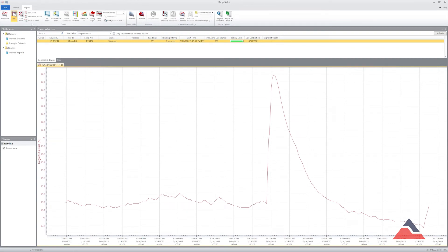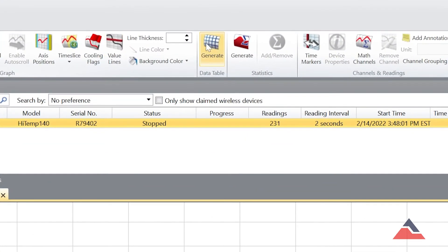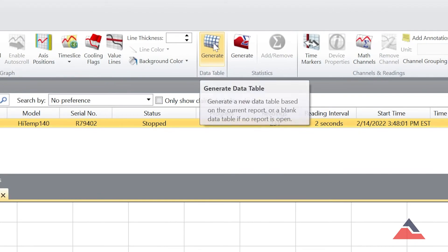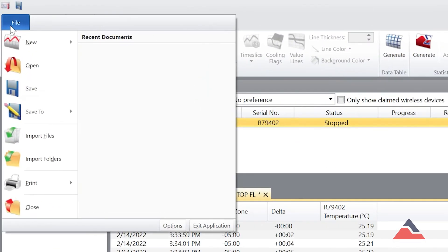To create a data table or statistics report, select Generate in the menu bar at the top of the program. Reports can be saved, printed, and exported to Excel as needed.